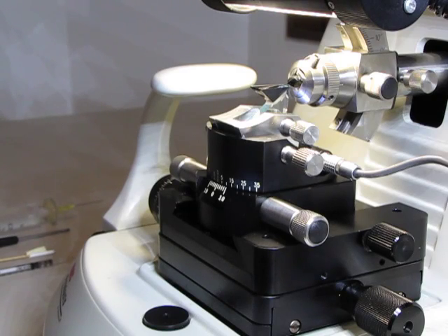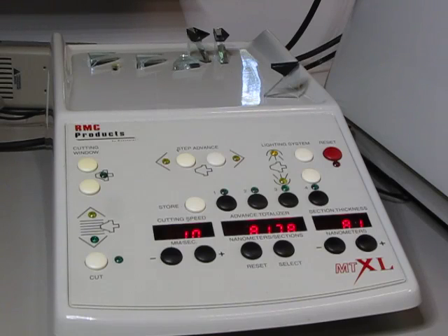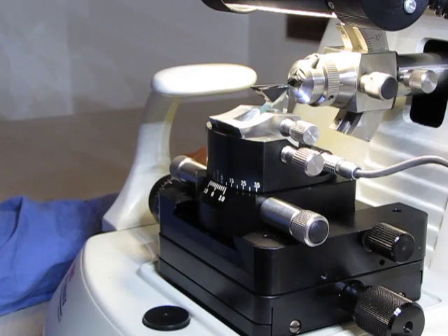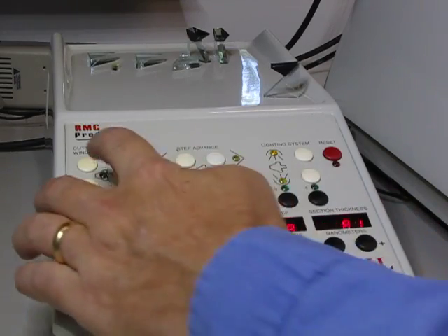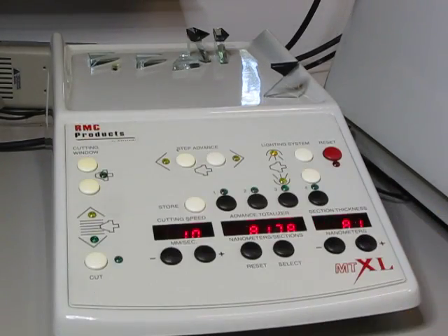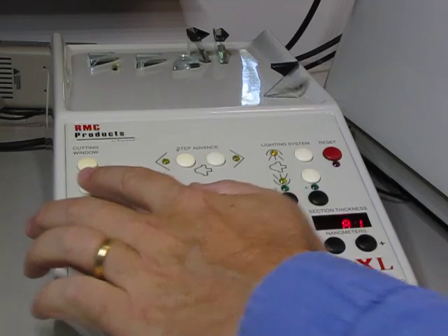Now to cut the thin sections we're going to let the motor do the work. Now the nice thing about this microtome is that it will cut slowly to cut the section and then return to the next cut quickly. But we need to tell it where that slow part is versus the fast part. And that's using the cutting window control on the microtome controller. Position the sample roughly two to three block heights above the knife edge and press the upper cutting window button. Then lower it so that you're just below the knife edge and press the lower cutting window button.